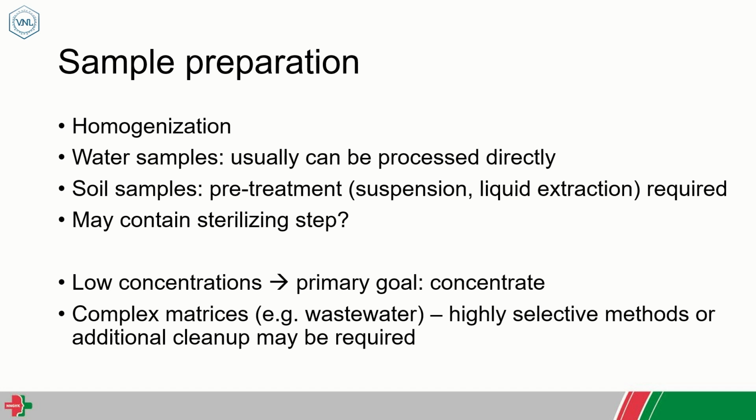First, usually there is a homogenization step, and then in most cases, the water samples can be processed directly, while soil samples require pre-treatment steps. During these steps, we must focus also on the biosafety issues.